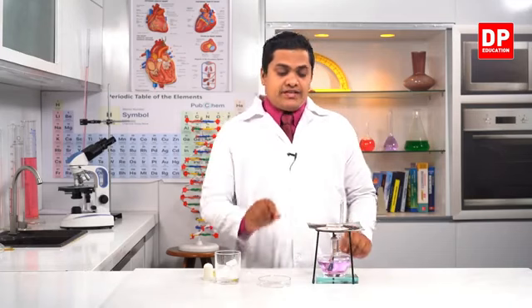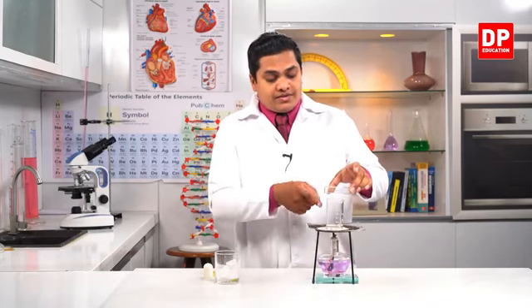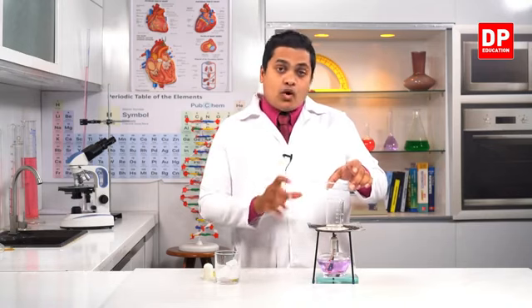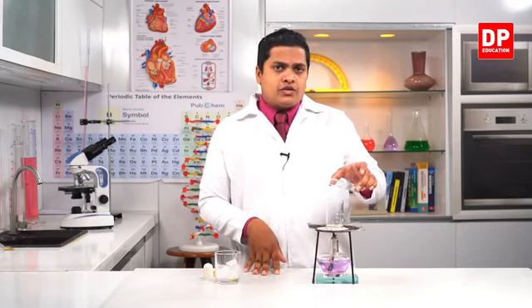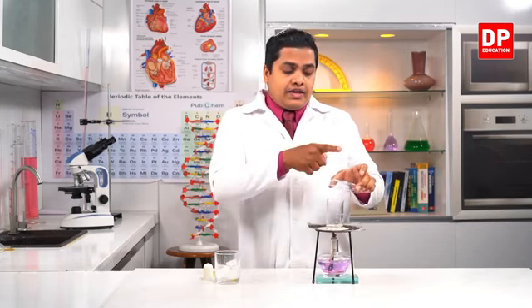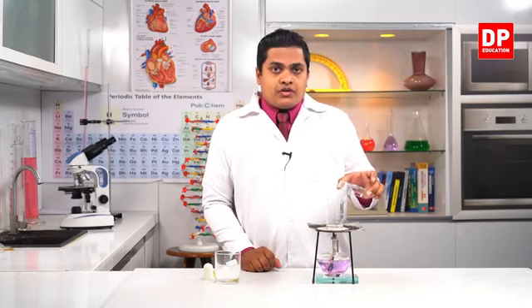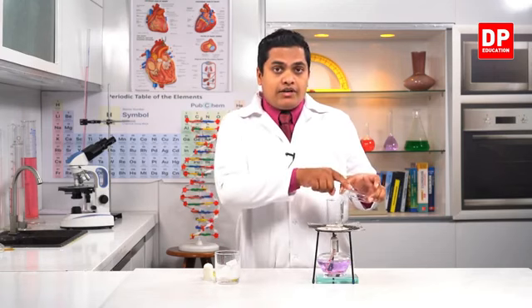So when I place this petri dish above the system like this, the vapor coming from the system is going to hit the petri dish, and after some time the water vapor is cooled down and turns into water droplets. So in this state, you can see that the gaseous water vapor is deposited as liquid droplets on the petri dish. So in this state change, we can observe a gas getting converted into a liquid on the petri dish.